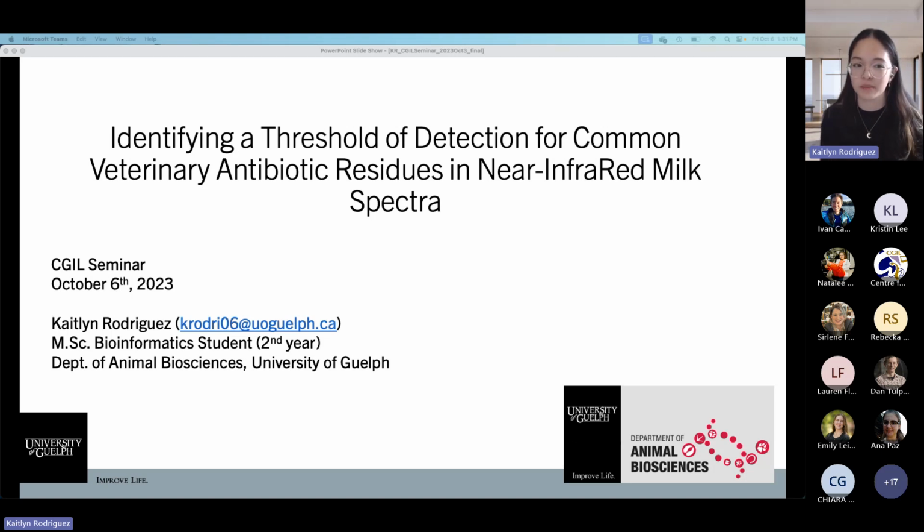I am very excited to be able to share a part of my thesis project today, which involves identifying a threshold of detection for common veterinary antibiotic residues in near-infrared milk spectra.